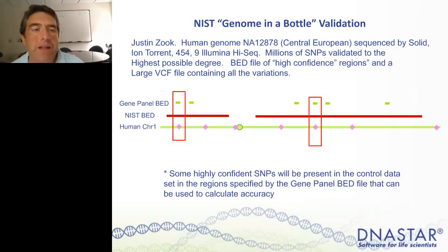So the Genome in a Bottle, the author of Genome in a Bottle is Justin Zook. This is human genome NA12878 Central European, sequenced by all different platforms to high depth. And what Genome in a Bottle is then, I have kind of this crude diagram.